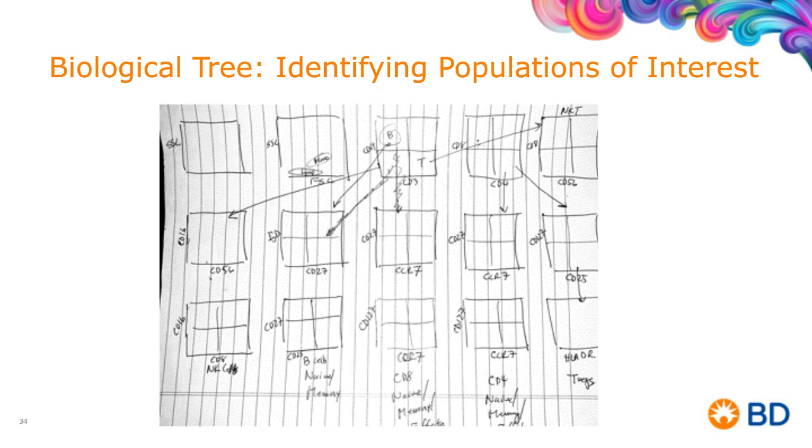We know how many low expressors. We know how many high expressors. If it's a broad panel, we know there's multiple lineages, so separate panels. And this is a great place to start. But unfortunately, not everyone does, and we're going to look at that at the very end.